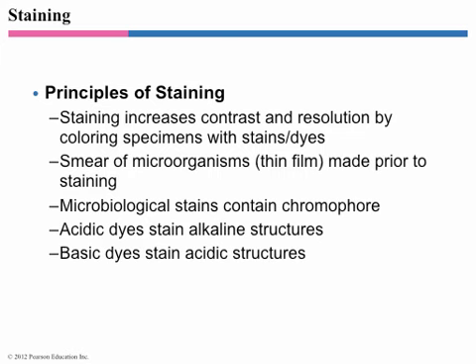So if you're a cell biologist or a human biologist, you're going to be looking at a lot of human cells that are stained to highlight particular organelles and such like. While that is of interest to us in microbiology, most of what you're going to be looking at are bacteria. So most of the stains that we're going to talk about today are stains that you would use in a situation with bacteria.